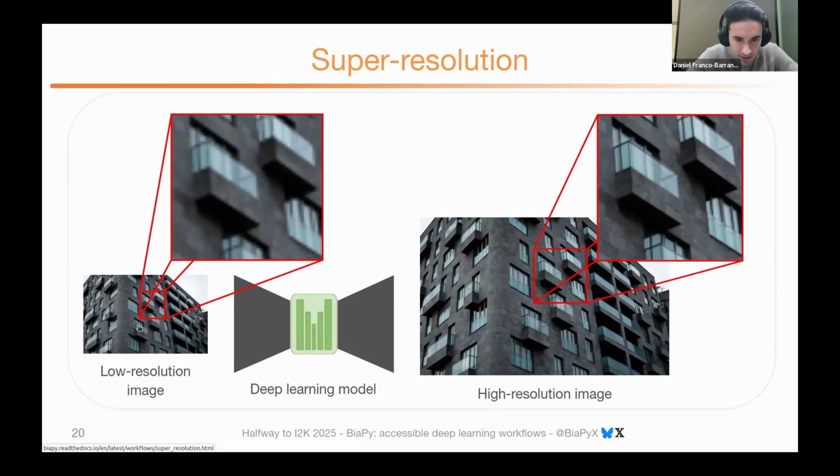Yes, there is a question. So you don't have detection with bounding boxes in 2D? No, we don't support this. We tackle the problem of detection, but by predicting the center of mass.